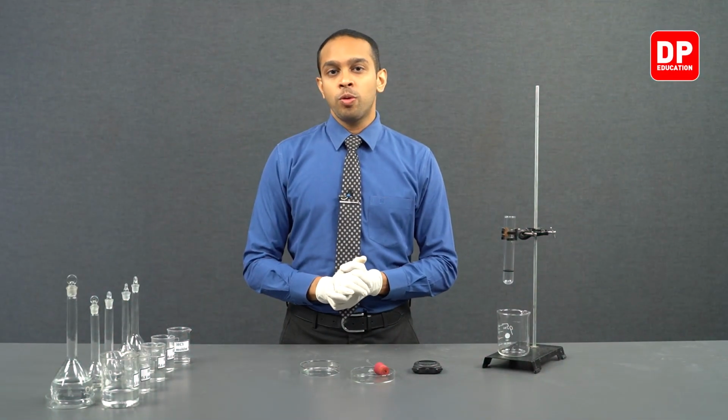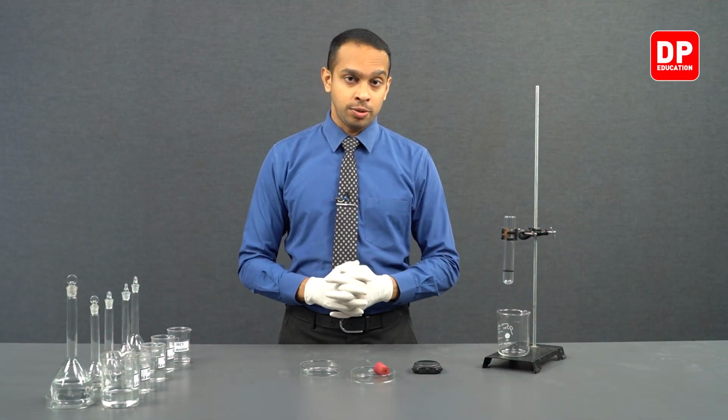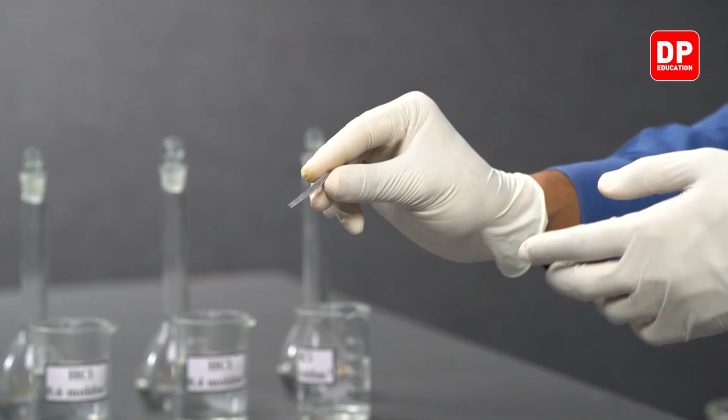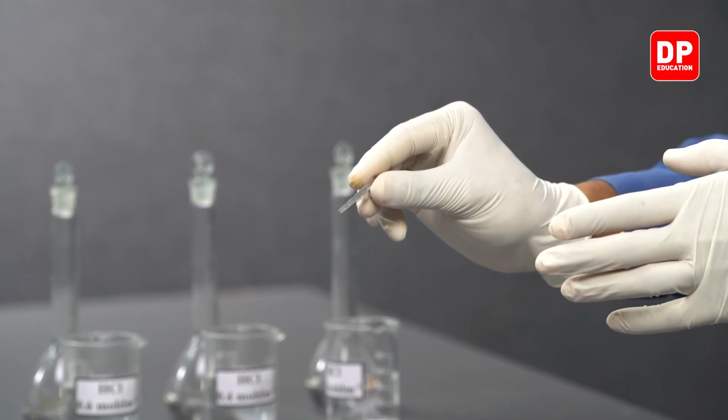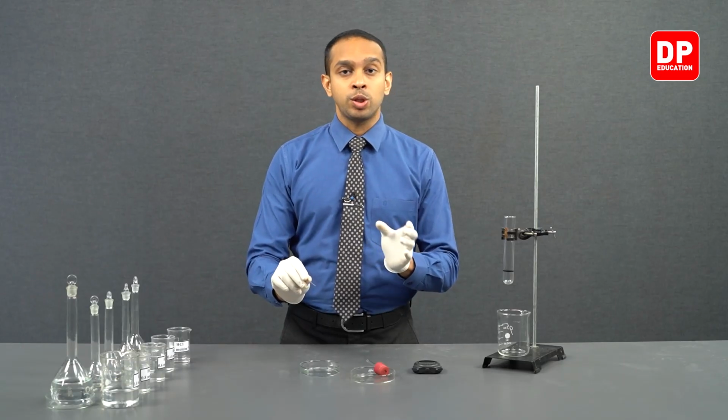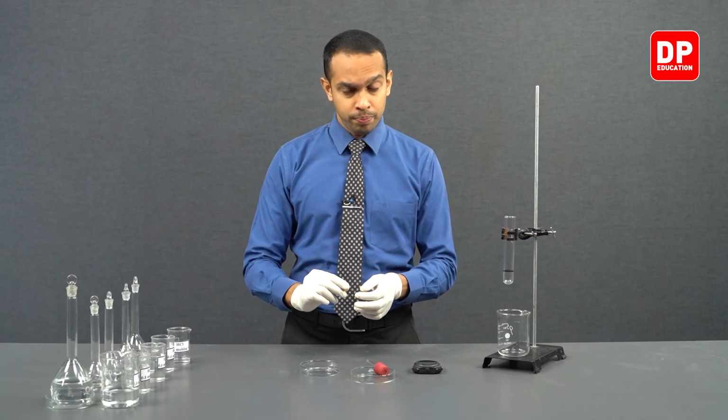Now we move on to the second experiment. In this experiment as well, we will be taking a strip of magnesium that is equal in length to the length of the magnesium strip that was used in the previous step.